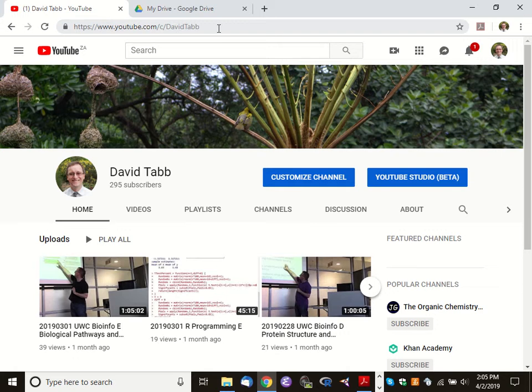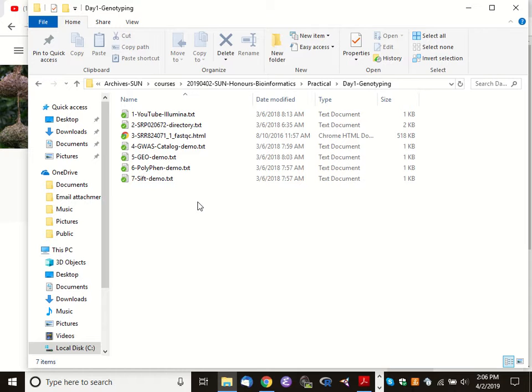All right, so by now, hopefully, you have had access to the files that we made accessible for this class. I'm sorry that the Wi-Fi network is grieving us, and as I said, it may shortcut a lot of what I would like to demonstrate today. I had actually started with a YouTube video from Illumina that I thought was really useful in explaining a little further how massively parallel sequencers work.